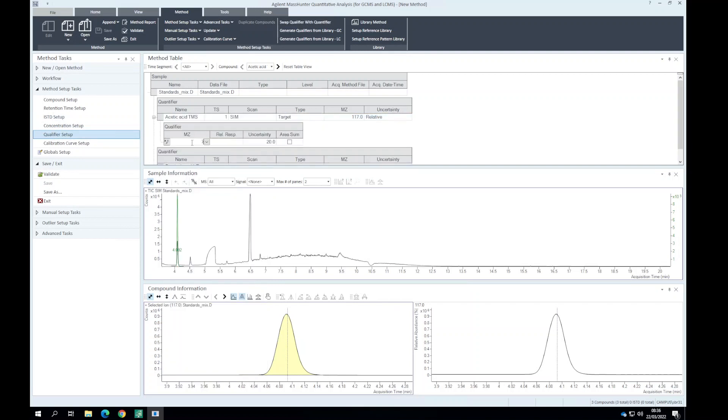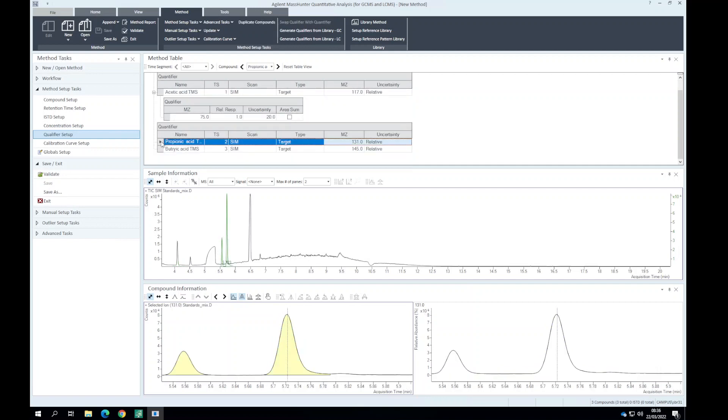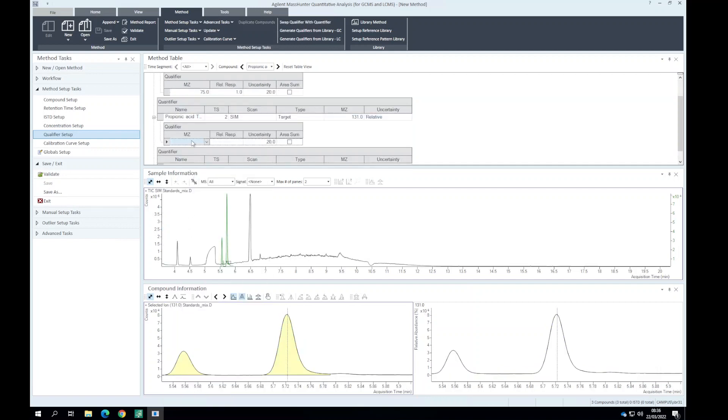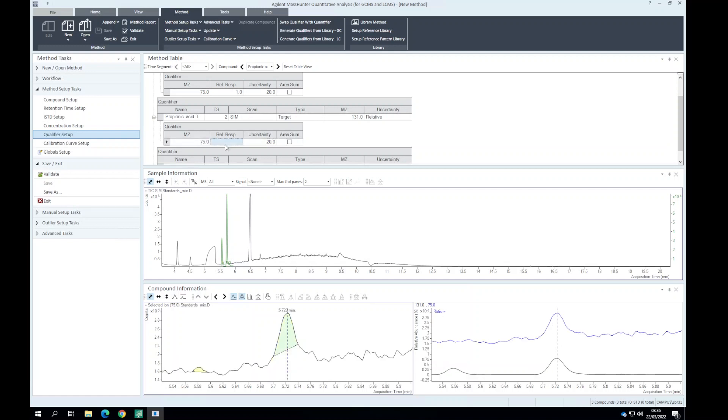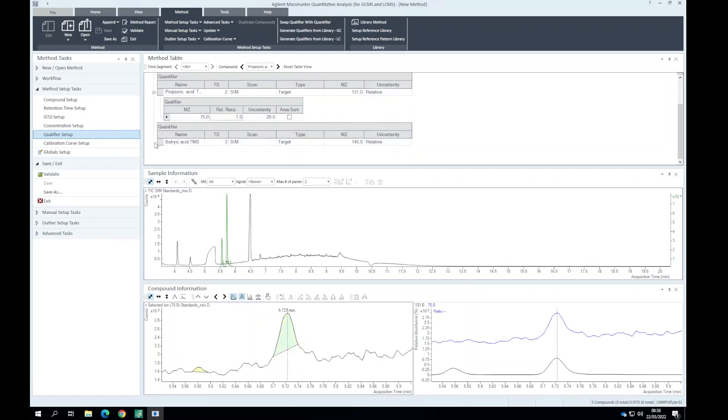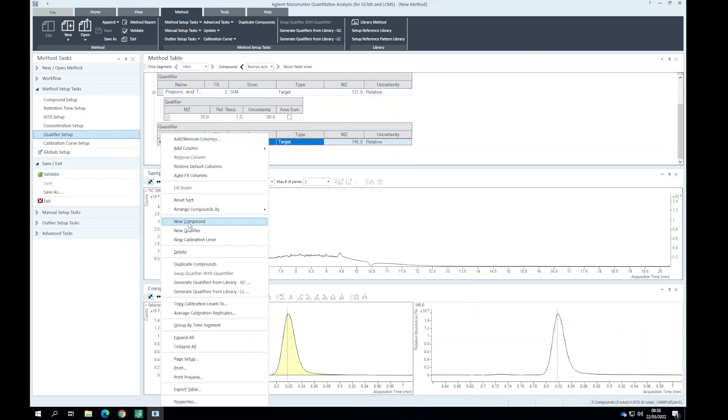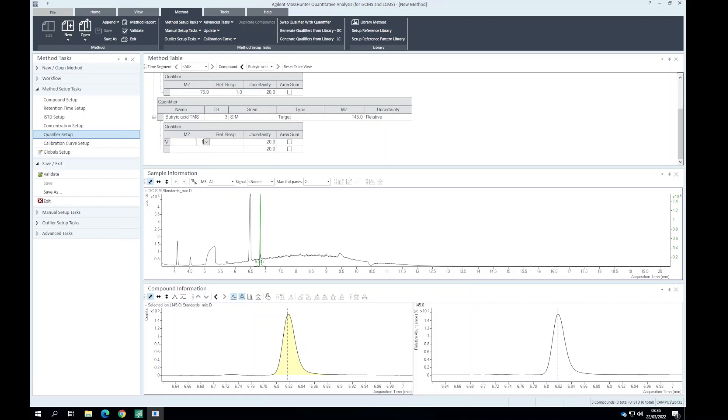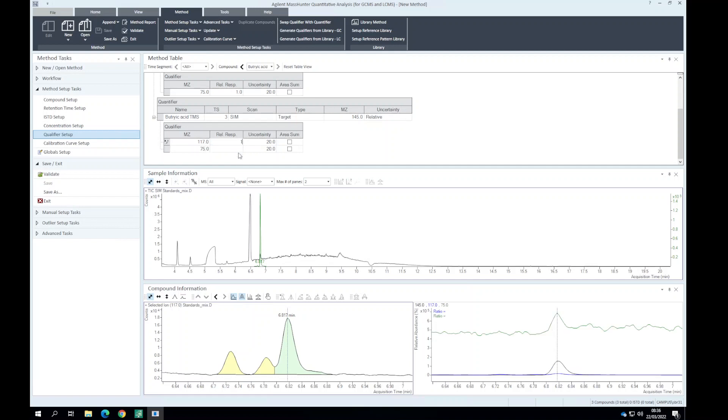So we have 75 and for now the response is 1. For propionic acid we've got 75 as well. And for butyric acid we've got two qualifiers, that is 117 and 75.